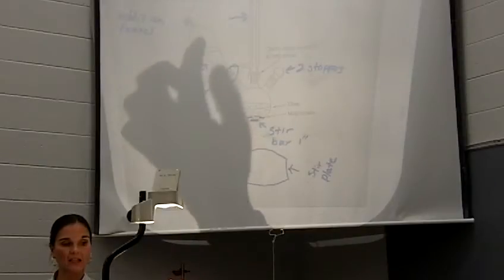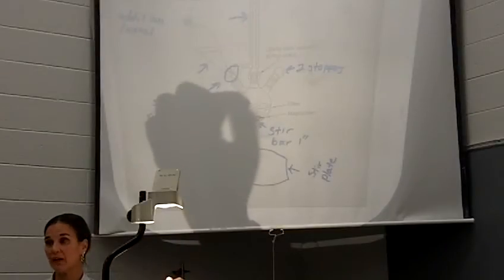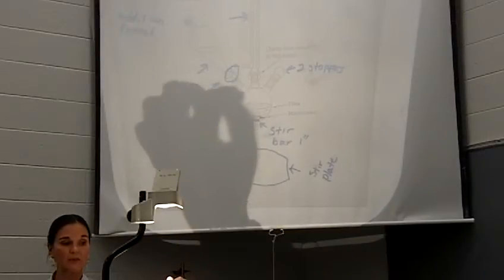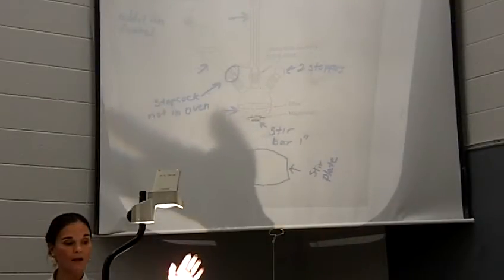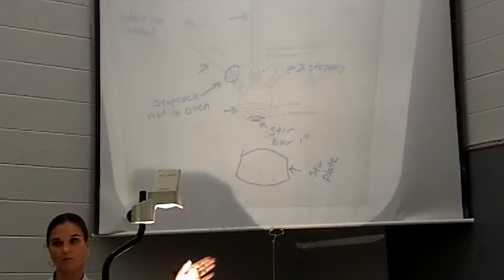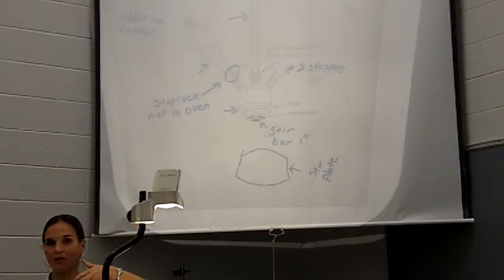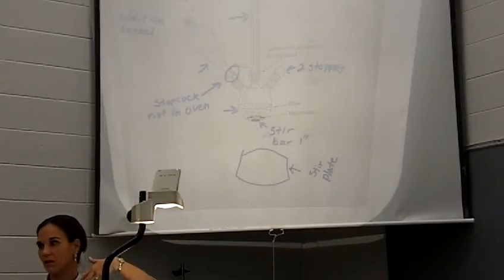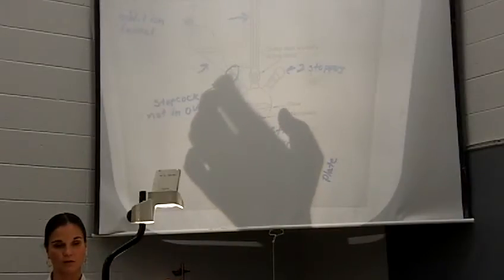Then you want to start adding that alkyl bromide dropwise, okay? And you want to keep it refluxing. You want to keep it under control, but you want to keep it refluxing while you're adding that alkyl bromide, okay? All the while, have you turned on your stir bar yet? No, do not turn on your stir bar. Because if you do, you'll kick up the ether vapor and you'll start drawing in the oxygen that we've been trying to keep out of your reaction and the moisture we've been trying to keep out of your reaction, okay? So no stirring during the Grignard reagent formation.